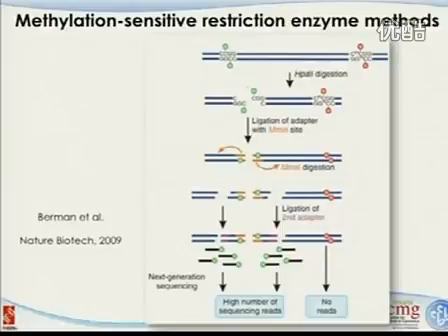So if you have a cut at this location, your sequencing will proceed from there. And then once you do the bioinformatics, you see a lot of signals in that particular region, you know that cutting has occurred. If there's another CpG site and the cutting was not detected, you probably know that it has been methylated.